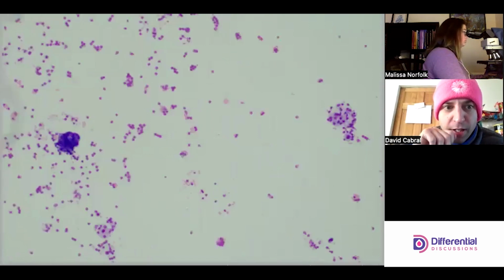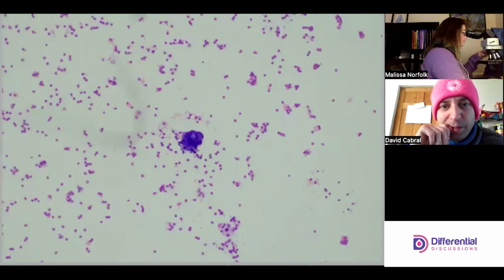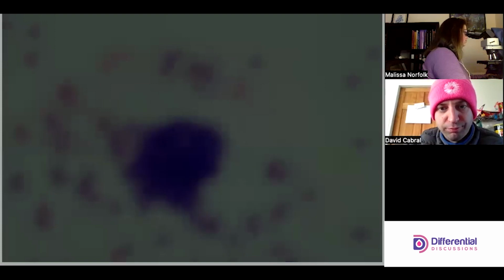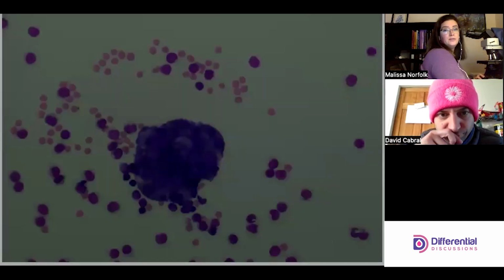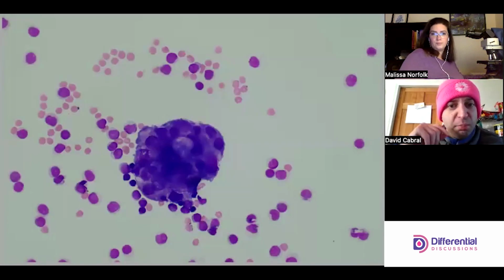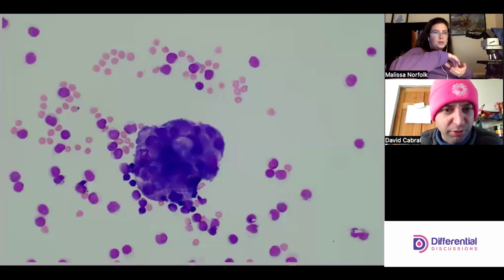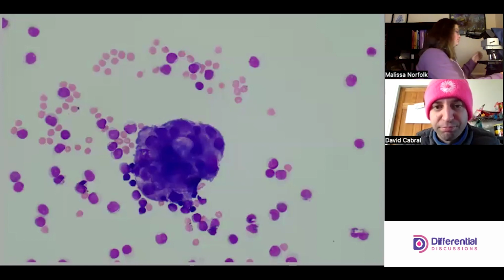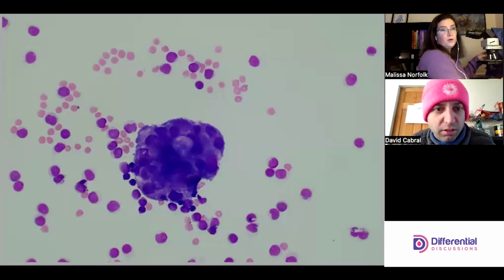Now, is that a second blob? Yep, blob number 2. All right, I'm going to go down to 40 on it again. Sounds good. And then raise the light. Yeah, I think that's a little bit better. We can see a little more detail here, but it's still very blobby. You can tell it's three-dimensional. We'll go back to 10 and finish our scan.